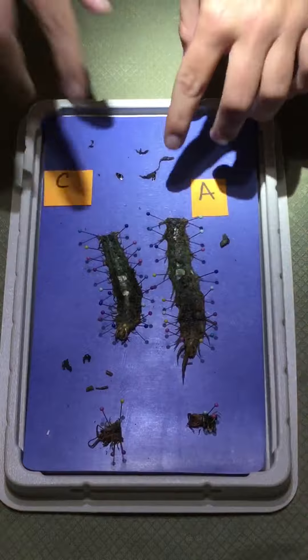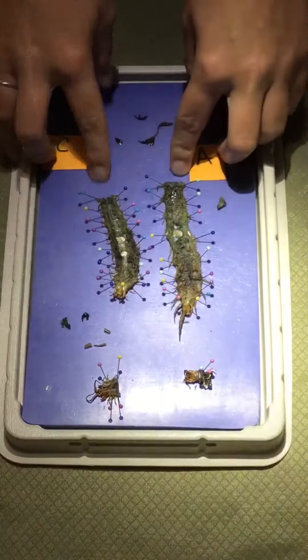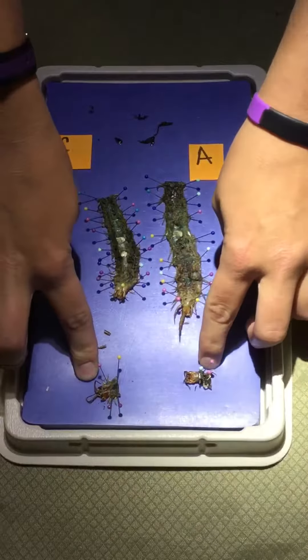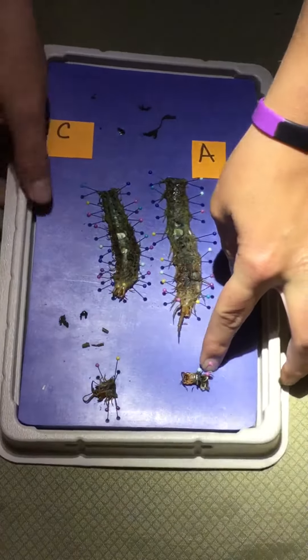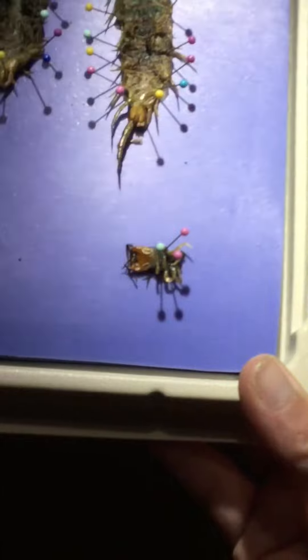As you noticed, we cut off the heads — right here is head C and right here is head A. This one is not cut open, but as we cut open this one you can see inside the head. I'll try to move it.